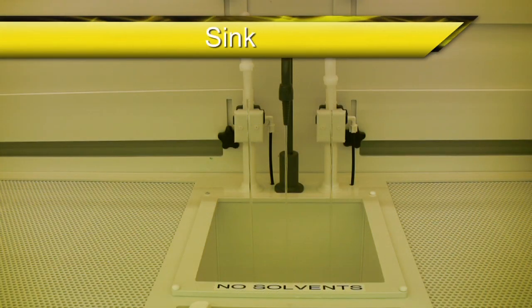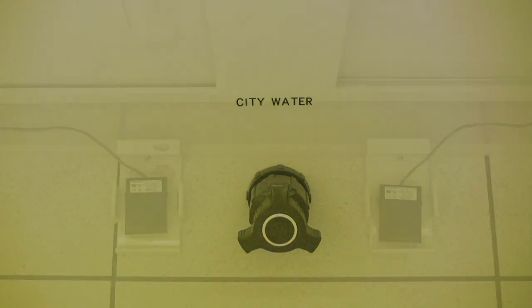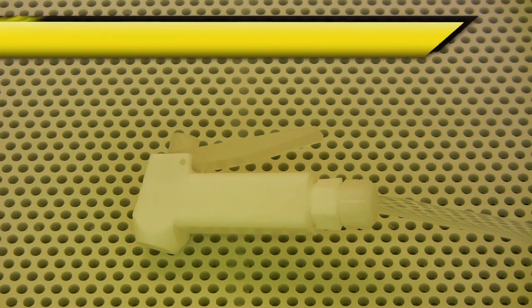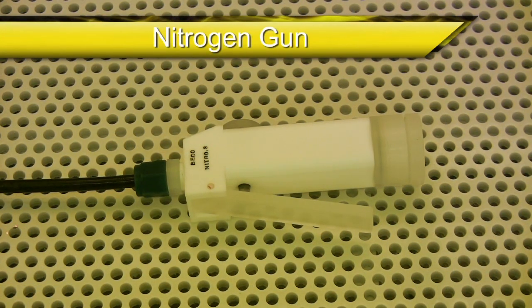The wet bench is equipped with a sink which has both city water and deionized water running to it. The city water can be turned on by turning a nozzle located on the front of the wet bench, while the deionized water can be turned on by pressing the foot pedals located at the base of the wet bench. There is also a deionized water spray gun and a nitrogen gun for drying your samples with filtered nitrogen, both found at the front of the wet bench.